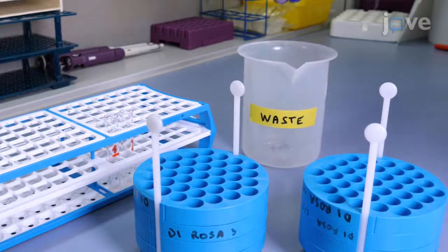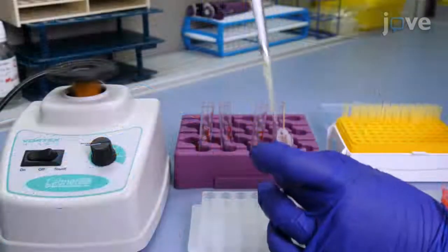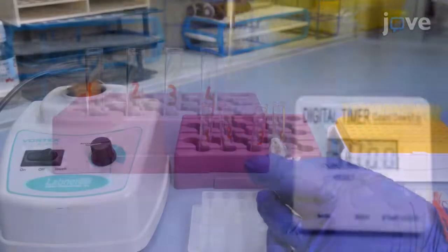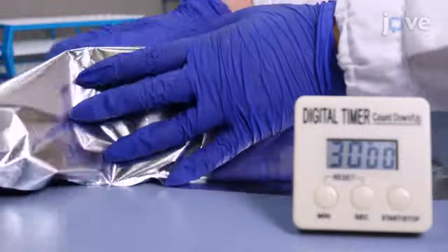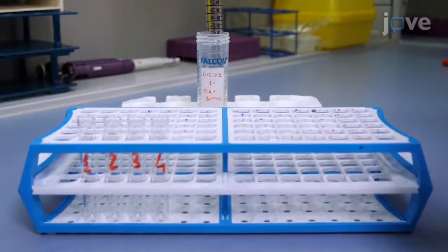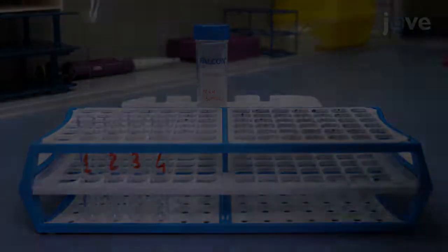Then, discard the supernatant. Add 100 microliters of diluted monoclonal antibody Ki-67 FITC to the pellet, then vortex and incubate for 30 minutes in the dark. After the incubation, wash the cells twice with 4 ml.